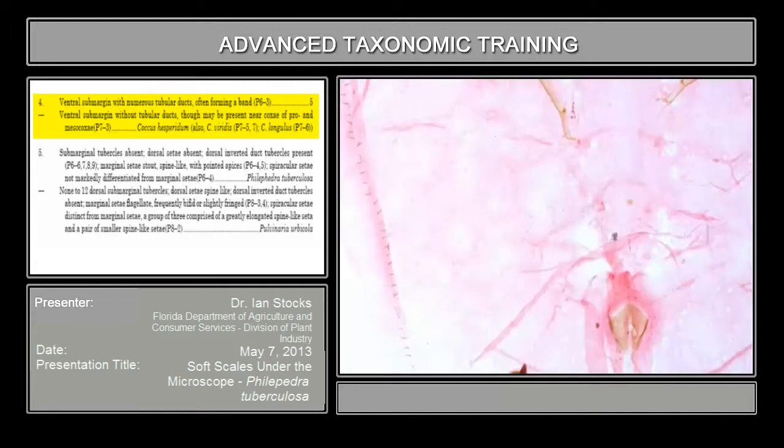When they're present, they're almost entirely restricted to a region just on the interior of the legs at the bases. This makes sense because if you look at these animals in the field, they're almost naked. They produce very little wax. The extent of the wax they make is just a very thin film that covers the body, and it's glassy. It just barely covers the body, so you can see the body quite clearly. And that then corresponds to a lack of structures that produce that wax.